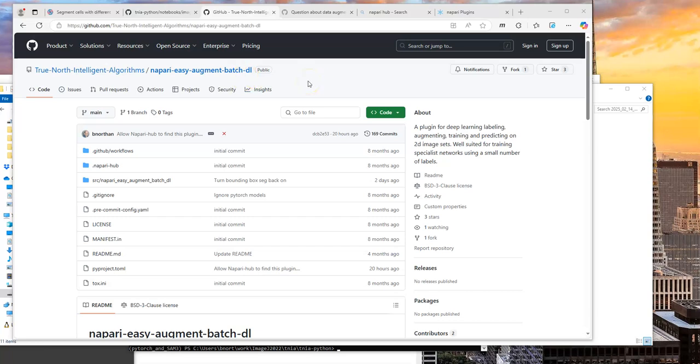It's a Napari widget, which I've shown before in some of my videos and notebooks. Usually my workflow is I write a notebook to do deep learning, pop up the viewer to do the labeling and maybe some augmentation, and then do the training in code. But again, today I'm going to see if I can do everything in the GUI.